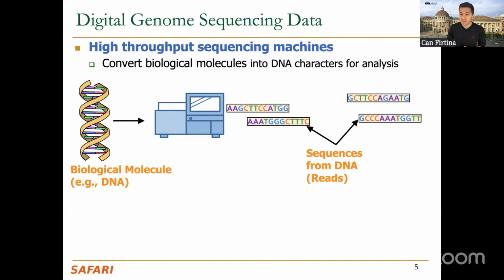When we say a read, it is essentially a fragment of the DNA. That fragment is read or sequenced by a sequencing machine, and the corresponding raw data of that read is generated, but that raw data is still a read. Then you can base call that read, and a base called version of that read is generated, but the base called version is also still called a read.